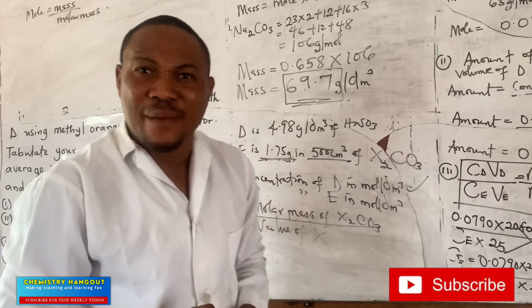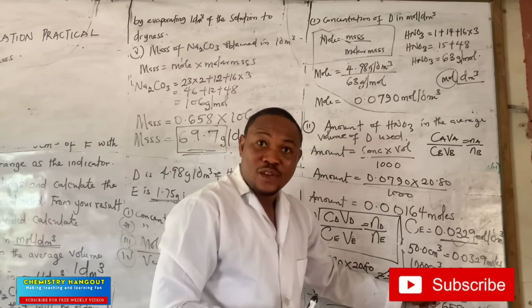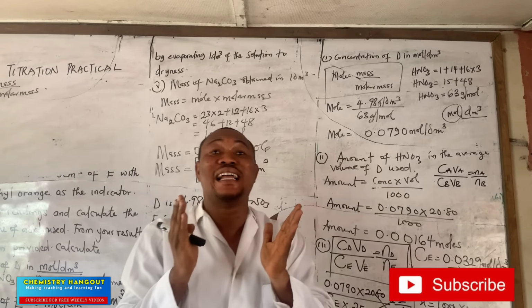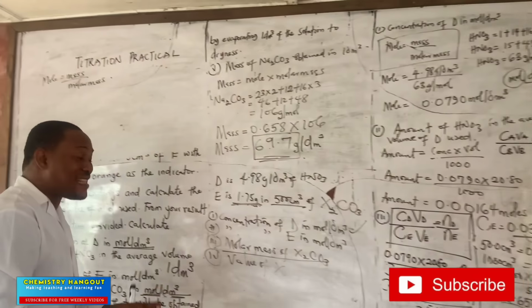Have you noticed something in chemistry? That they are always obeyed with 1000 cm³. No matter what they give us, we must look for it in 1 dm³, because that's the standard measurement in the chemistry laboratory. That's the standard measurement.